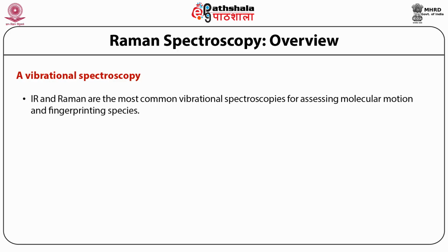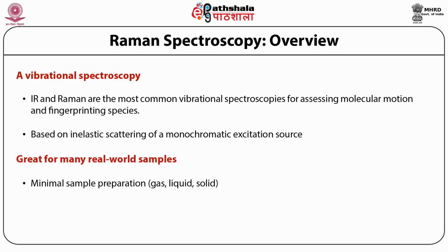An overview of Raman spectroscopy. IR and Raman are the most common vibrational spectroscopies for assessing molecular motion and fingerprinting species. Based on inelastic scattering of a monochromatic excitation source, minimal sample preparation. Sample could be a gas, liquid or a solid. So it is minimal sample preparation and it is compatible with wet samples and at normal ambients.